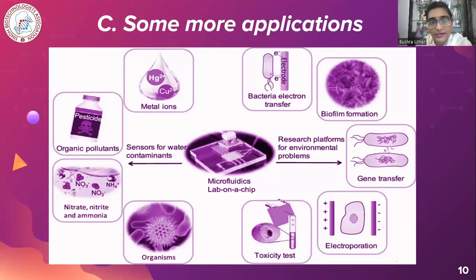There are some other applications of microfluidic technology. We have learned about the example of volatile organic compounds detection, which comes under these things, or environmental contaminants detection.